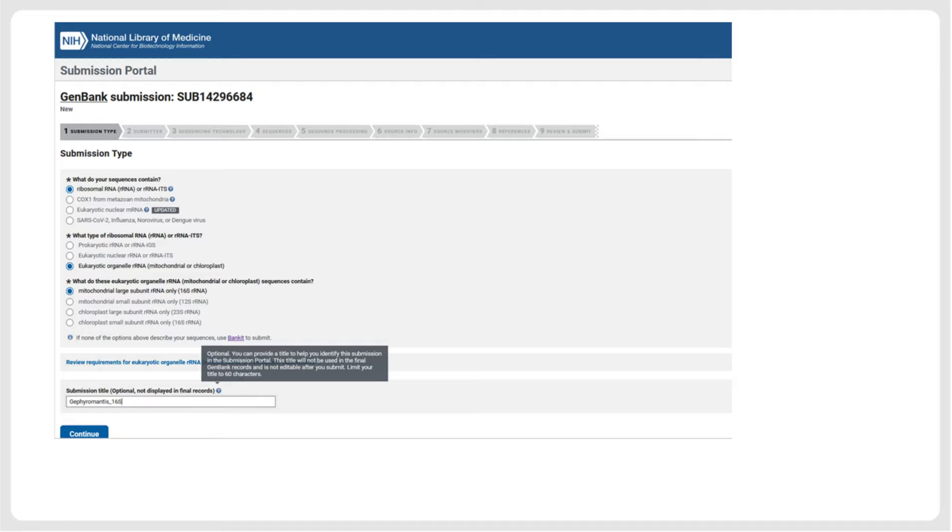You then have to specify the marker you want to submit. The Submission Portal allows the submission of several highly used markers, such as ribosomal RNA genes or the DNA barcode gene CO1. For sequences of other genes, as of 2023, they need to be submitted via BankIt, which we will show in the third chapter of this tutorial.